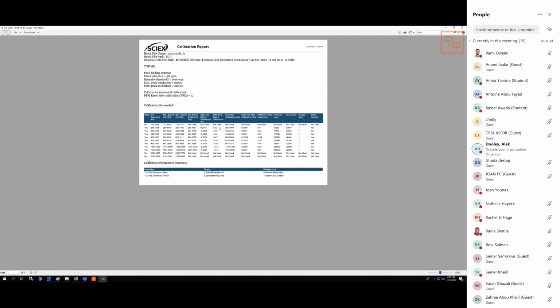And if we change the dimension of the time of flight tube, then we will, of course, change the time that it takes the ions to travel. So for that reason, maybe we turn on the system and then we didn't give it enough time because it was off, or let's say not used for 1 month.